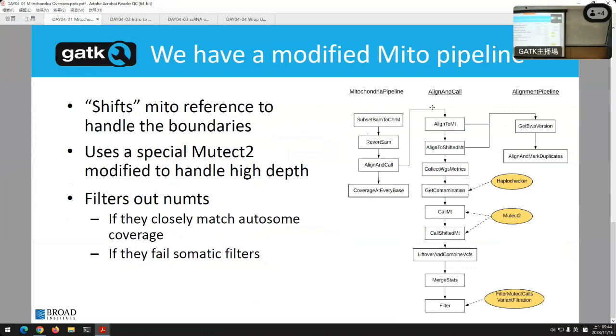Now, remember I mentioned mitochondrial DNA being circular causes a problem? When you're trying to lay out the bases on the chromosome, you pick a start, you pick an end, and you align to that. Well, there's no real start or end. I guess that's just a circle thing, kind of by definition. So the problem is, how do we handle that? To some degree, okay, you pick an arbitrary point, right? In our reference, we cut there and say that is 0, and we just number our way around. Simple enough. The problem is that has nothing to do with nature.